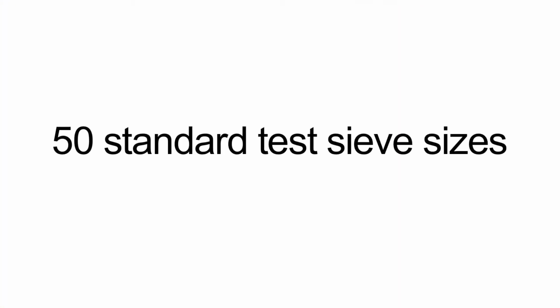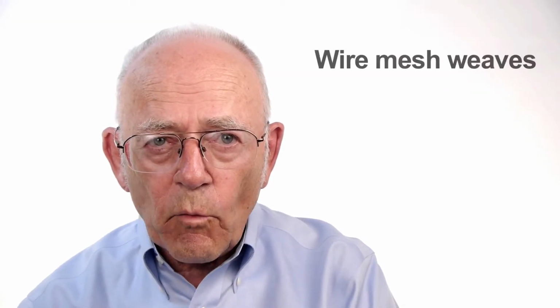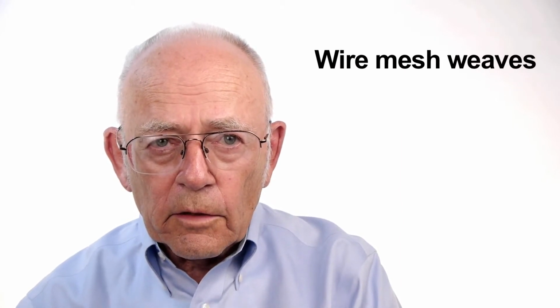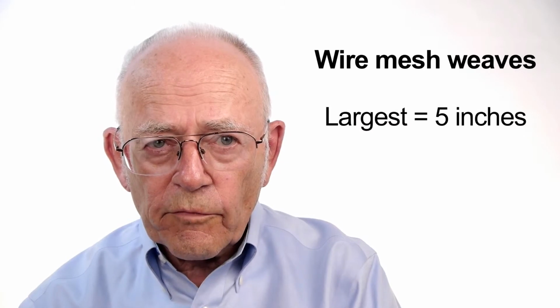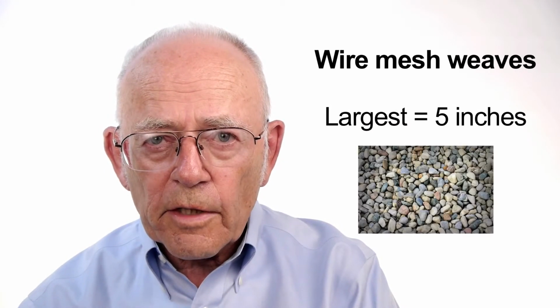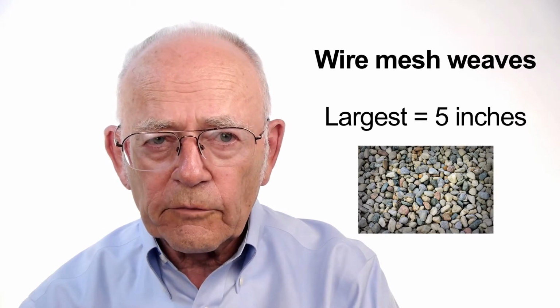In between are just over 50 standard test sieve sizes. The range of openings is achieved by different weave sizes of wire mesh. The largest standard is a mesh with 5-inch openings. That's pretty big. Substantial sized rocks will pass through these openings.